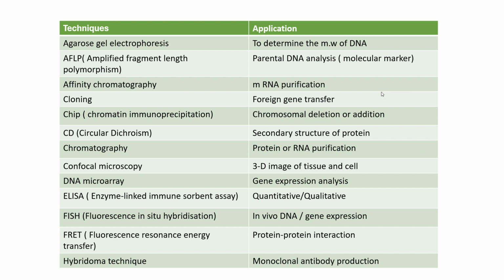The smallest molecular weight DNA moves faster in the agarose gel electrophoresis plate. By applying this, we can determine the molecular weight, because the larger and the smaller molecular weight can be differentiated or recognized.